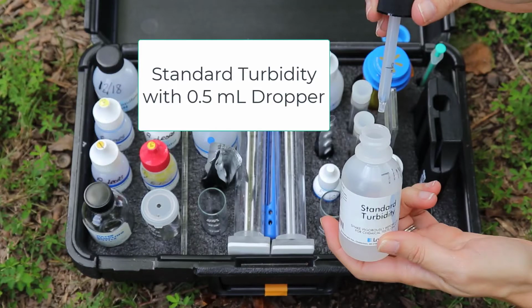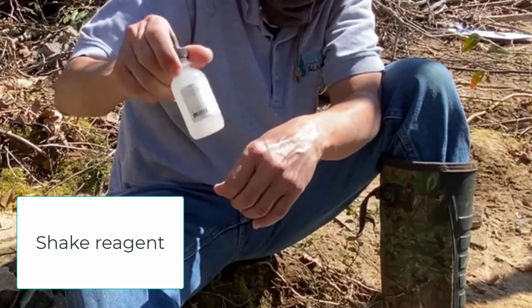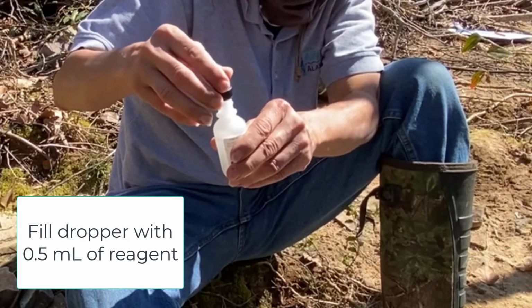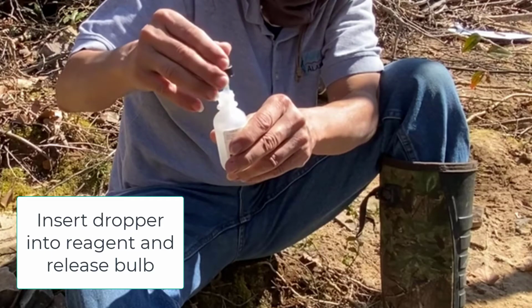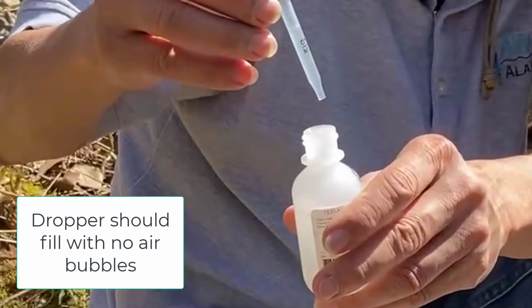To start, find the standard turbidity reagent and the dropper that is marked at the 0.5 milliliter line. Shake the reagent vigorously, and then fill the dropper with 0.5 ml of the reagent. To do so, hold the dropper vertically. Squeeze the bulb and then insert the dropper into the reagent bottle and release the bulb. The dropper should fill with no air bubbles. If air bubbles get into the dropper, squeeze the bulb to empty the dropper and refill it.